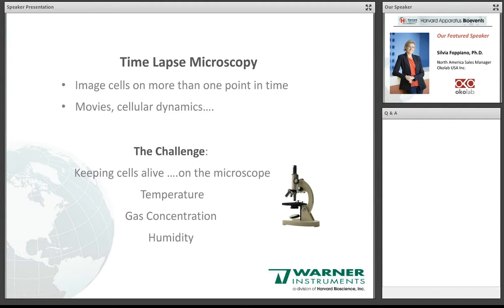Now, typically, tissue culture incubators are the size of, let's say, a medium to large size refrigerator, and they have control over temperature, gas concentration, and humidity. I like to stress the importance of humidity. Let's say you're flowing a warm gas over your culture media, in this case would be CO2, for 2 or 3 hours. This may be okay. But now envision doing it for 8 hours or a day or 2. You can see how the volatile compounds of the culture media will evaporate. This will change the media composition and will affect most likely your cellular behavior or even viability.